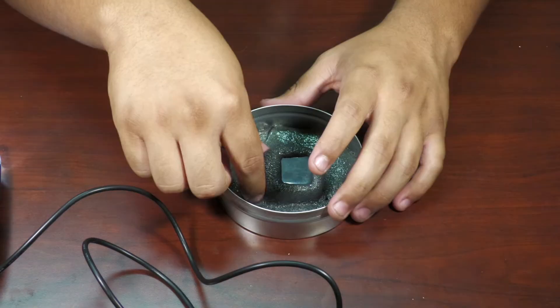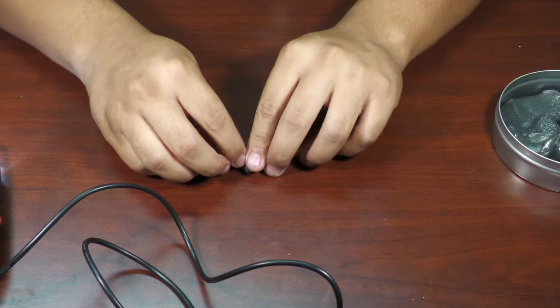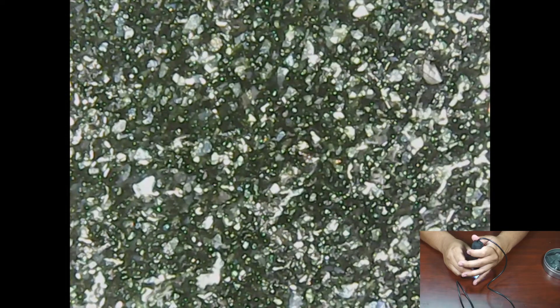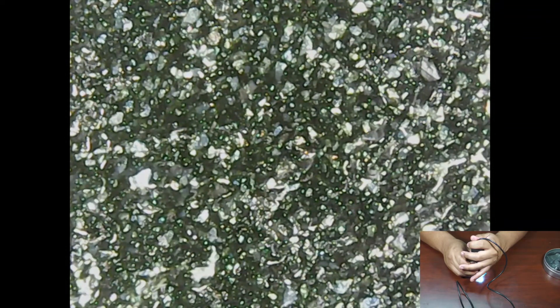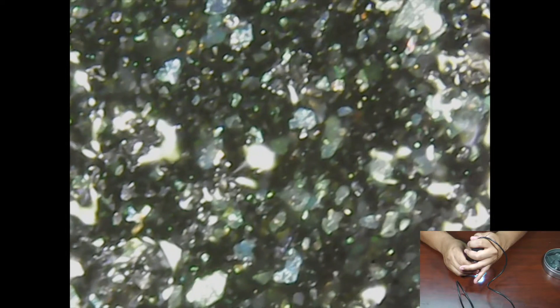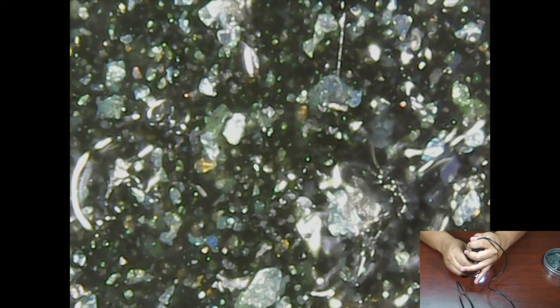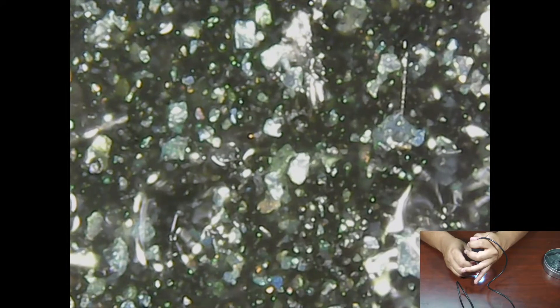Here we got the magnetic putty. We're just gonna take a little bit, flatten this thing out, and check it out under the microscope. They kind of look like fish scales. Maybe because of the light of the microscope, but everything is super shiny. Oh, they do look like fish scales. I wonder what kind of powder they put into this to make it so shiny — I don't think it's just the metal. Can you guys see those little bits of color? That's like a powder. They kind of remind me of stars.